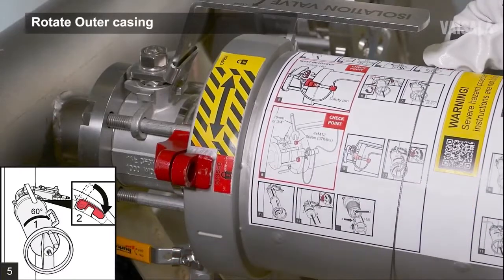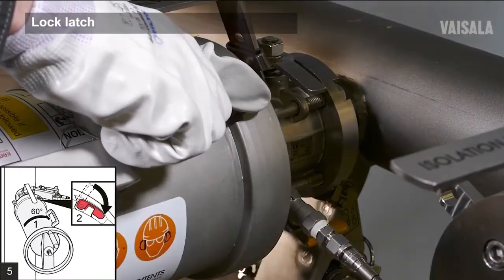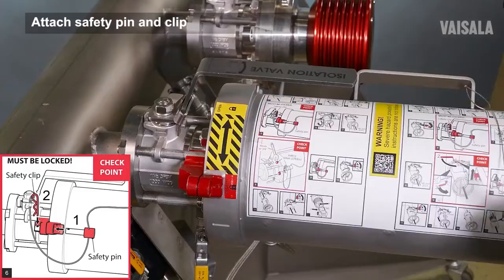Rotate the outer casing 60 degrees clockwise to lock the bayonet. Lock the outer casing latch. Insert the safety pin.